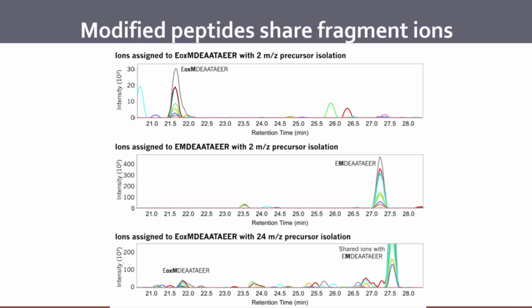So there are other PTMs here. Yes, so the simple answer is yes. This is a problem, and the only real solution here is to localize the modification specifically to the residue. You could say we're only going to accept an oxidized methionine if we have a fragment that says specifically that methionine is shifted by 16. The downside is that would be a b2 ion, which is not very specific in this case, and a lot of b ions are underrepresented.